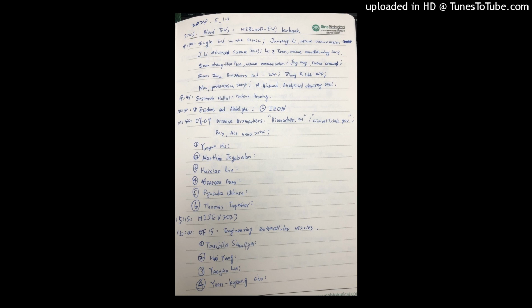How to normalize it, I have no idea, but if you would again measure simply platelet concentration, etc., at least you have an indication whether the sample quality is consistent or not. If there's a huge difference, you have a problem, but better to know that and report it than to pretend it doesn't exist.